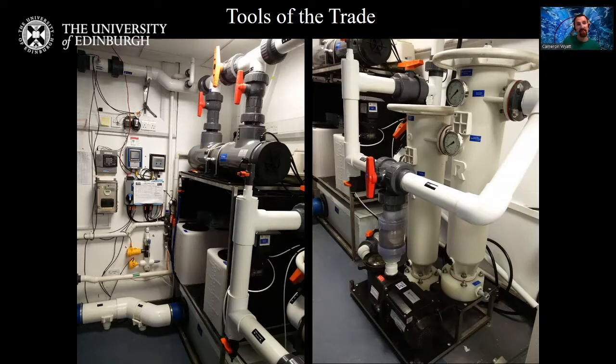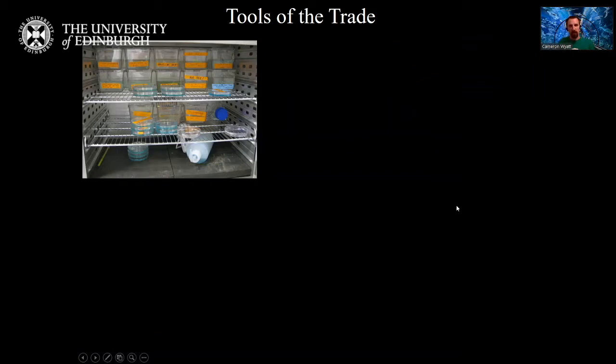Because we're constantly dealing with these stockings filled with carbon, every day in the fish room is a failed Christmas. And after going through these, it goes into the UV reactor at the top, which is essentially just a lot of very strong UV light sources, which then sterilize the water and kill the pathogens that might be in it. And then it goes back round to the tanks, and the cycle starts again. So that's the equipment that supports the main aquarium itself.